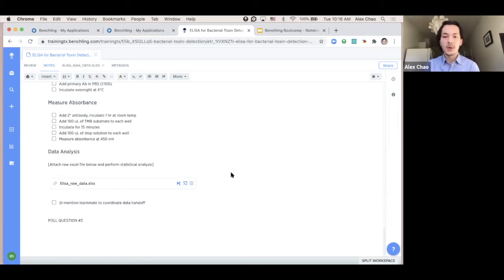Wonderful. It looks like most folks have voted, so I'm going to end this poll and share the results. Many folks, in fact 46% of you, said you send files via email often. And many of you also said you send them very often. Given this, we understand that there are multiple pain points with sending data via email. Hopefully I can show how we're able to utilize a feature on Benchling called the desktop sync application to mitigate some of these pain points.